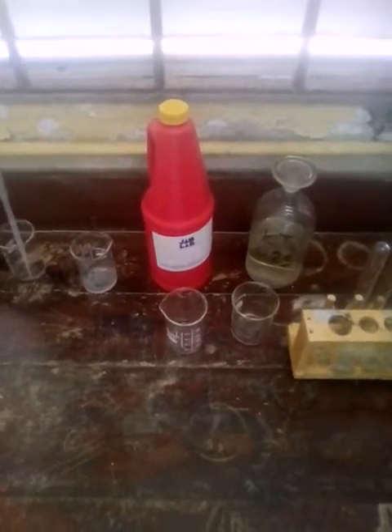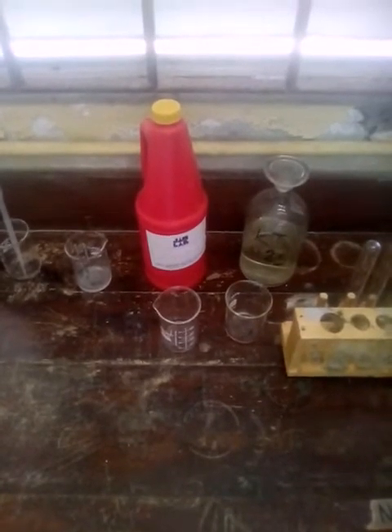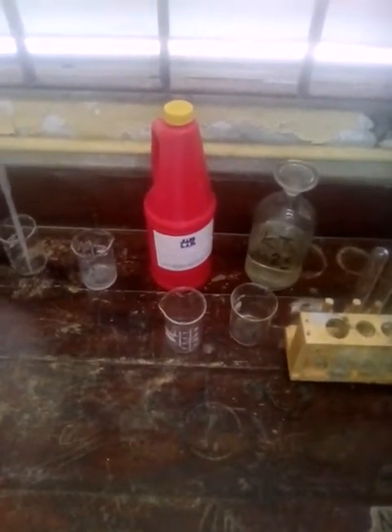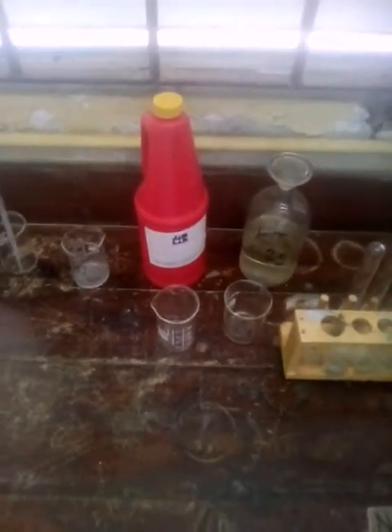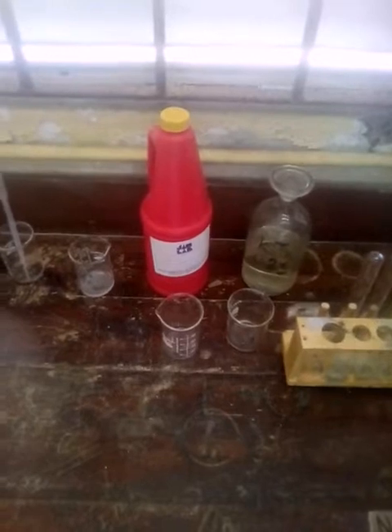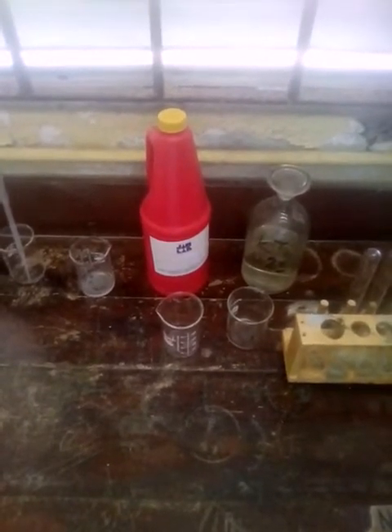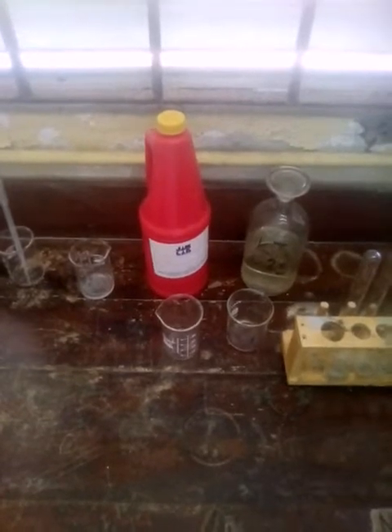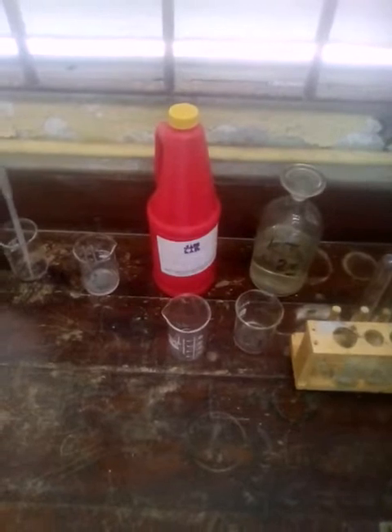Now, the reaction that we are going to perform is not going to be that vigorous because we are not going to be using concentrated reagents. We'll be using diluted reagents to perform this reaction. This form of reaction is a type of redox reaction.